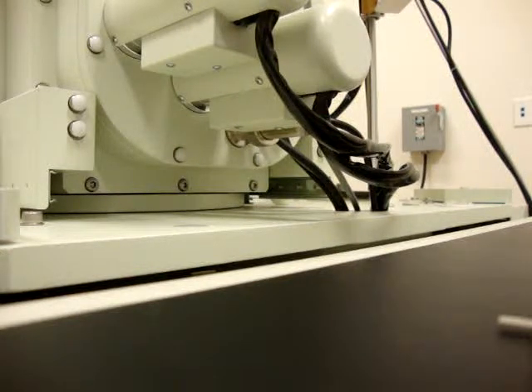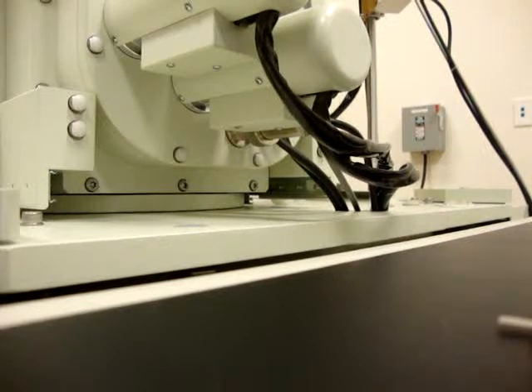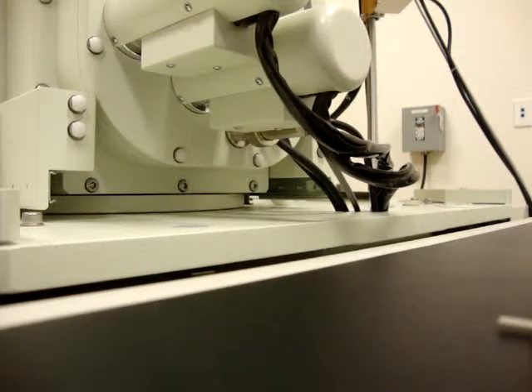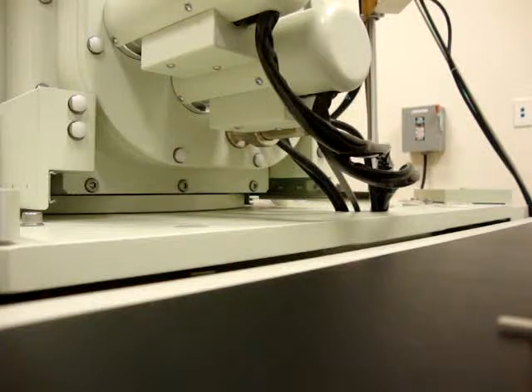Any questions? No. Okay, let's take that sample out. We'll turn it down and be ready for whoever else. As soon as it finishes, it just opens the save as window by itself. When the photo is finished, it opens up by itself. Just make sure you set your directory, or people will be throwing pictures in on top of it. So I'll just say the SEM user. Yeah, just make a folder on the desktop.